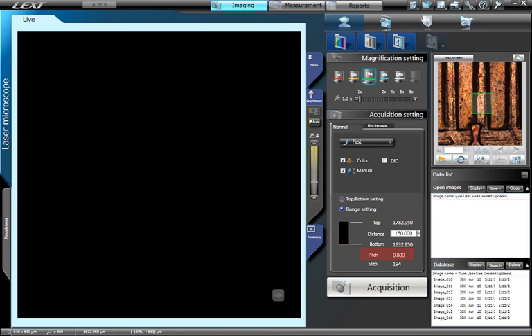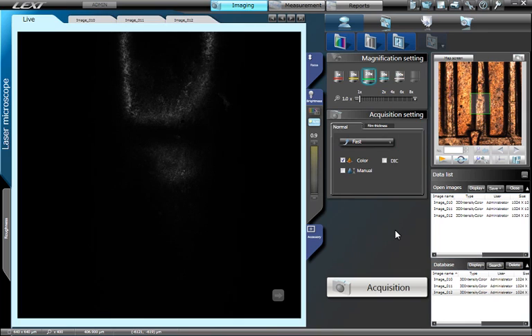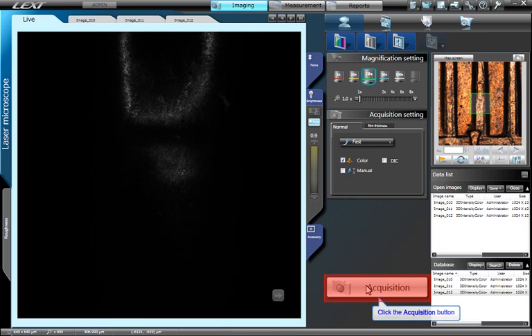The LEXT will automatically determine the pitch or distance between image slices as well as the amount of images to be acquired as a function of the objective lens. Selecting the Fast or Fine acquisition mode greatly influences these parameters. Now that we have selected the appropriate acquisition mode and have set our brightness, let's acquire a confocal image by simply pressing the Acquisition button.